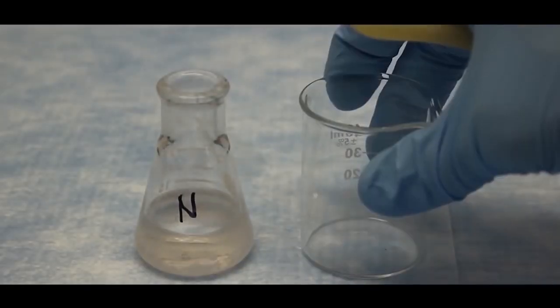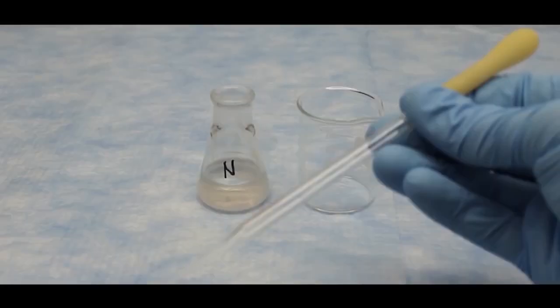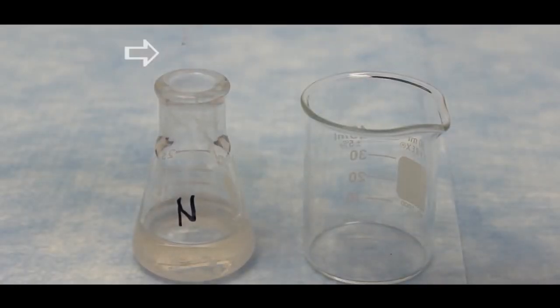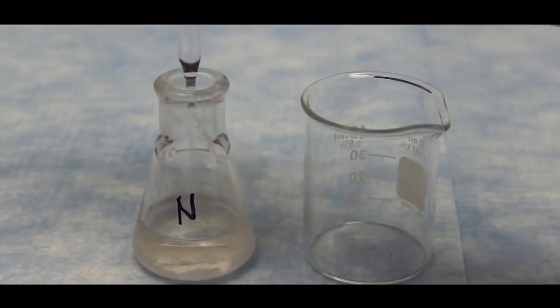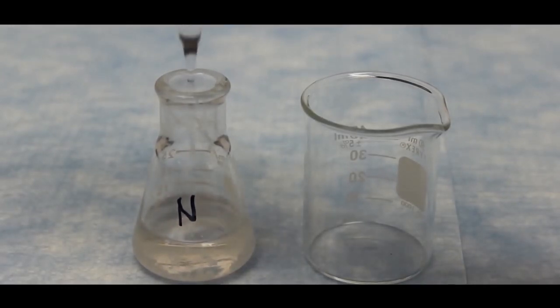After at least 10 minutes of drying with sodium sulfate, the neutral DCM extract, which should still contain phenanthrene, can be transferred to a beaker, leaving behind the solid sodium sulfate and the excess water it absorbed. The DCM may uncontrollably drip out of the pipette. To prevent this from happening during transfer, it can be sucked up a few times to equilibrate the inside of the pipette before attempting to transfer it.